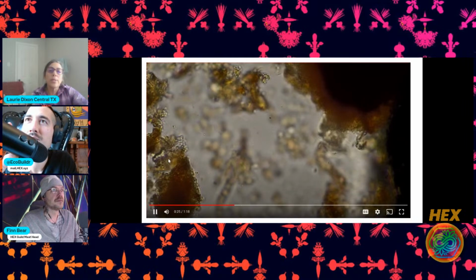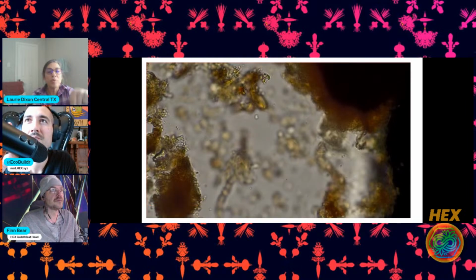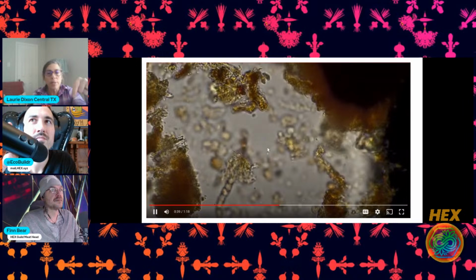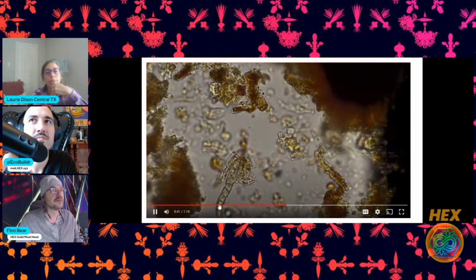So imagine that we're looking at the slide, we're looking at the top surface, and that slide is going down 15 layers. And so you have these different depths. These are on the top layer, that's what's in focus, and this stuff that's out of focus is lower down in the drop.